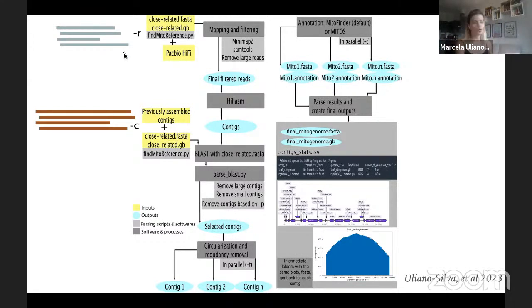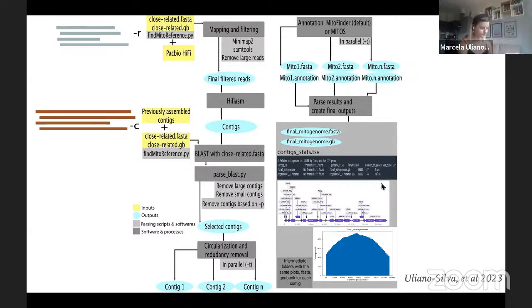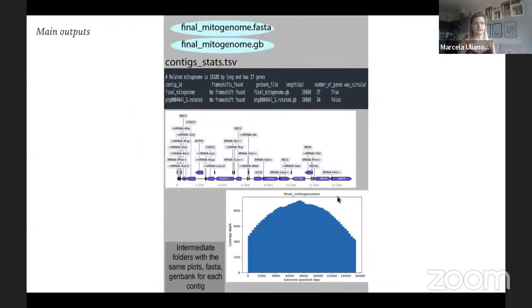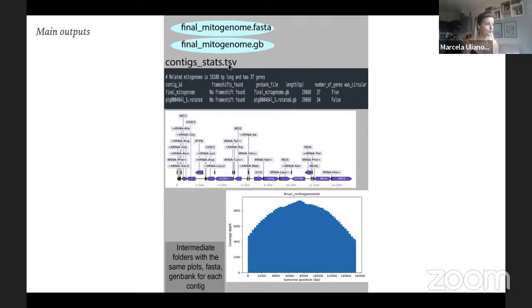If you start with contigs, the pipeline skips the mapping and HiFiasm steps — which is lighter on memory and resources — and just runs the BLAST step, then filtering, then annotation. Annotation is the bottleneck — it takes the longest. The main output, if MitoHiFi ran correctly, is a `final_mitogenome.fasta` file and annotation in GenBank format.